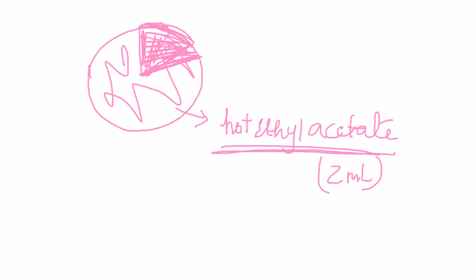Now, all of it goes in while it still is on the steam bath, so you shouldn't remove your steam bath from the hood. While it is still in there, if you see that all of your material goes into the ethyl acetate, then you might be able to add a little bit of petroleum ether along the sides, but when you cool it down, your aspirin should recrystallize.